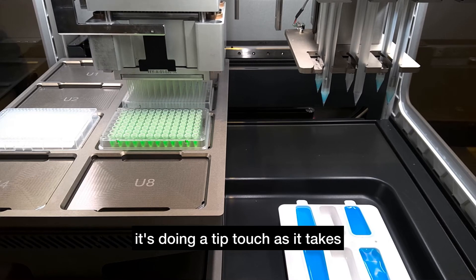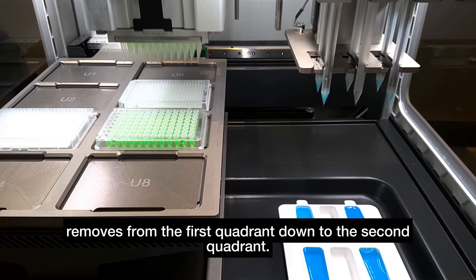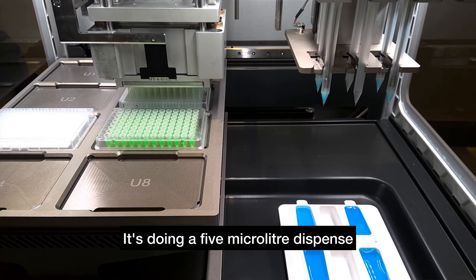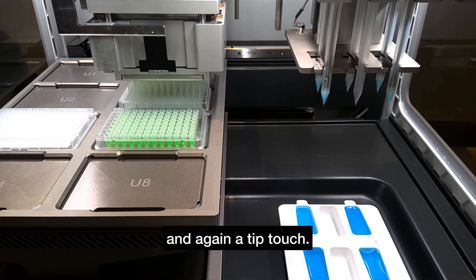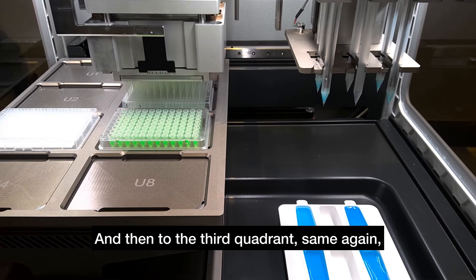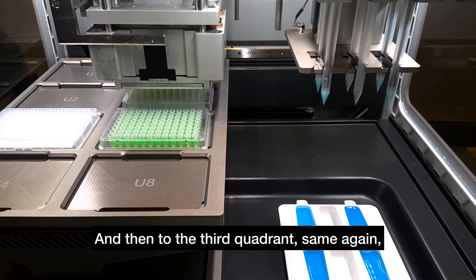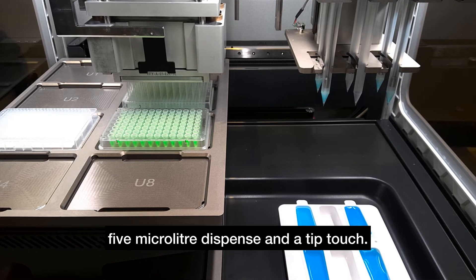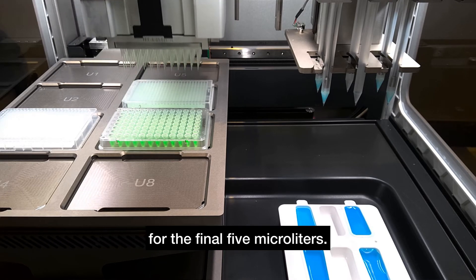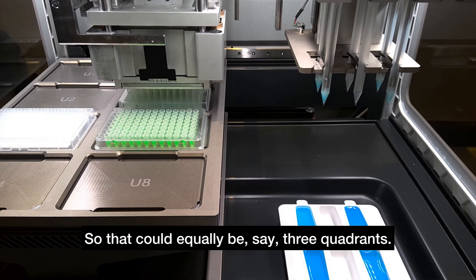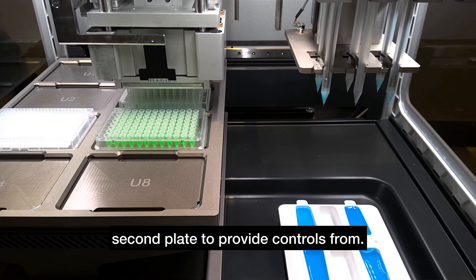It's doing a tip touch as it removes from the first quadrant, now into the second quadrant with a five microliter dispense and tip touch, then to the third quadrant with the same five microliter dispense and tip touch, and finally the fourth quadrant for the final five microliters. That could equally be three quadrants and then a second plate to provide controls.